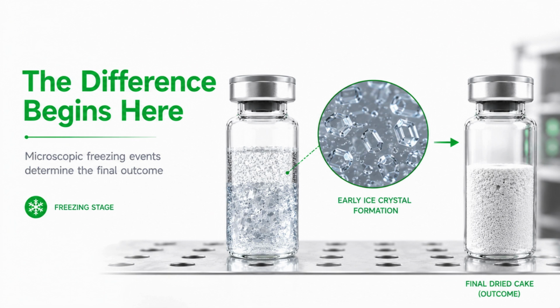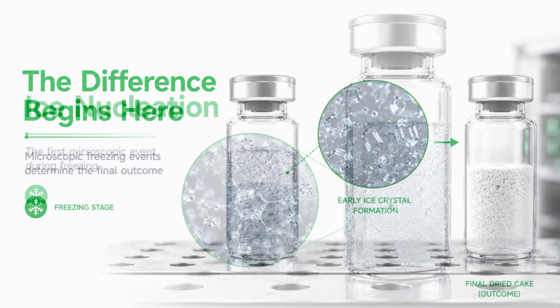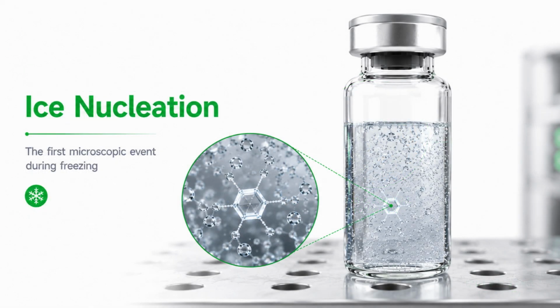Not during primary drying, not during secondary drying. It begins much earlier, during freezing. And it all starts with one microscopic event: ice nucleation.